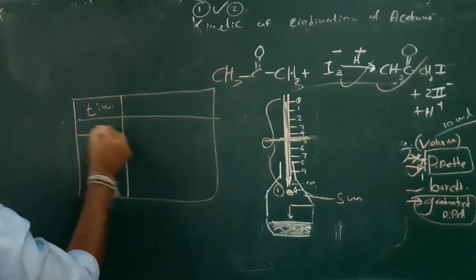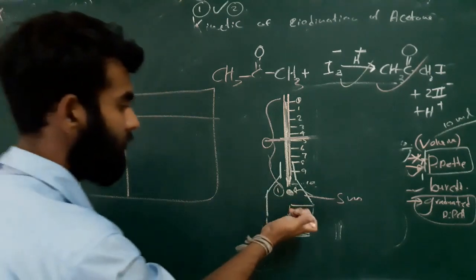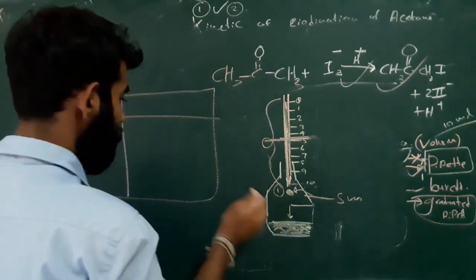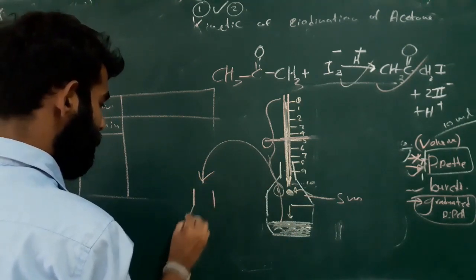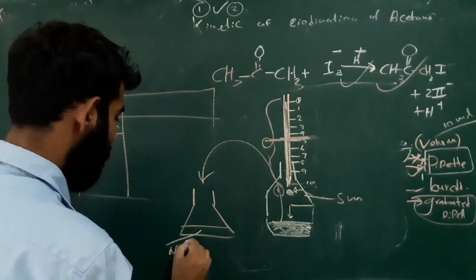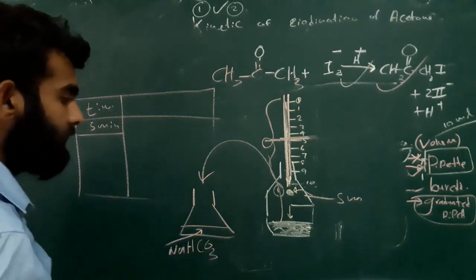At 5 minute intervals. After 5 minutes we will get 10 ml of this reaction mixture, and we will add it into a sodium bicarbonate solution. Why is that?